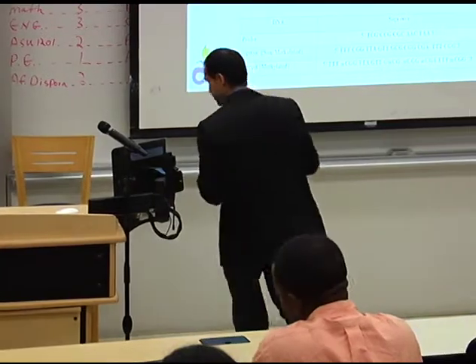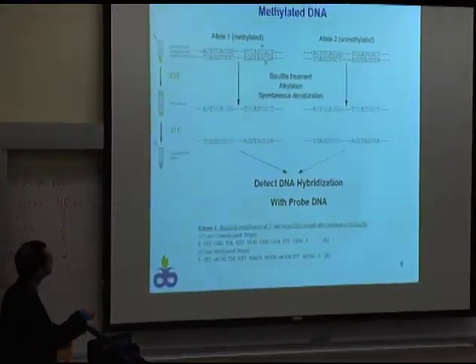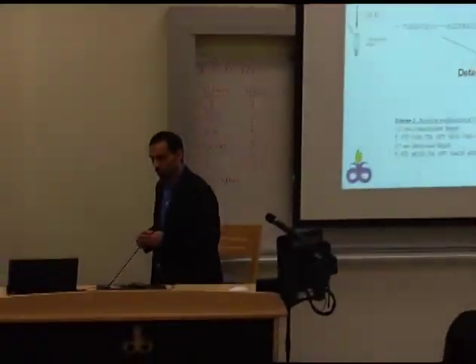So going back to this slide, they said it takes like 30 minutes, but it actually takes closer to 45 minutes to perform. Maybe with some practice, you can even get it down to about 35 minutes.